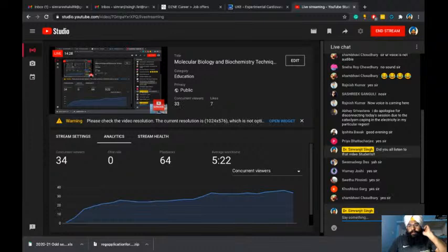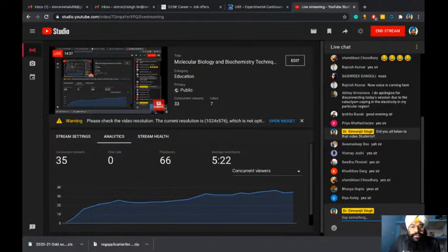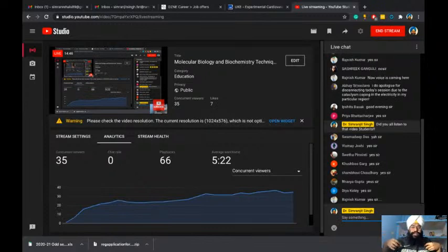so that was about the basics of 2D gel. You can see it's a long process, but if you keep working on a day and night basis, it will become very habitual.